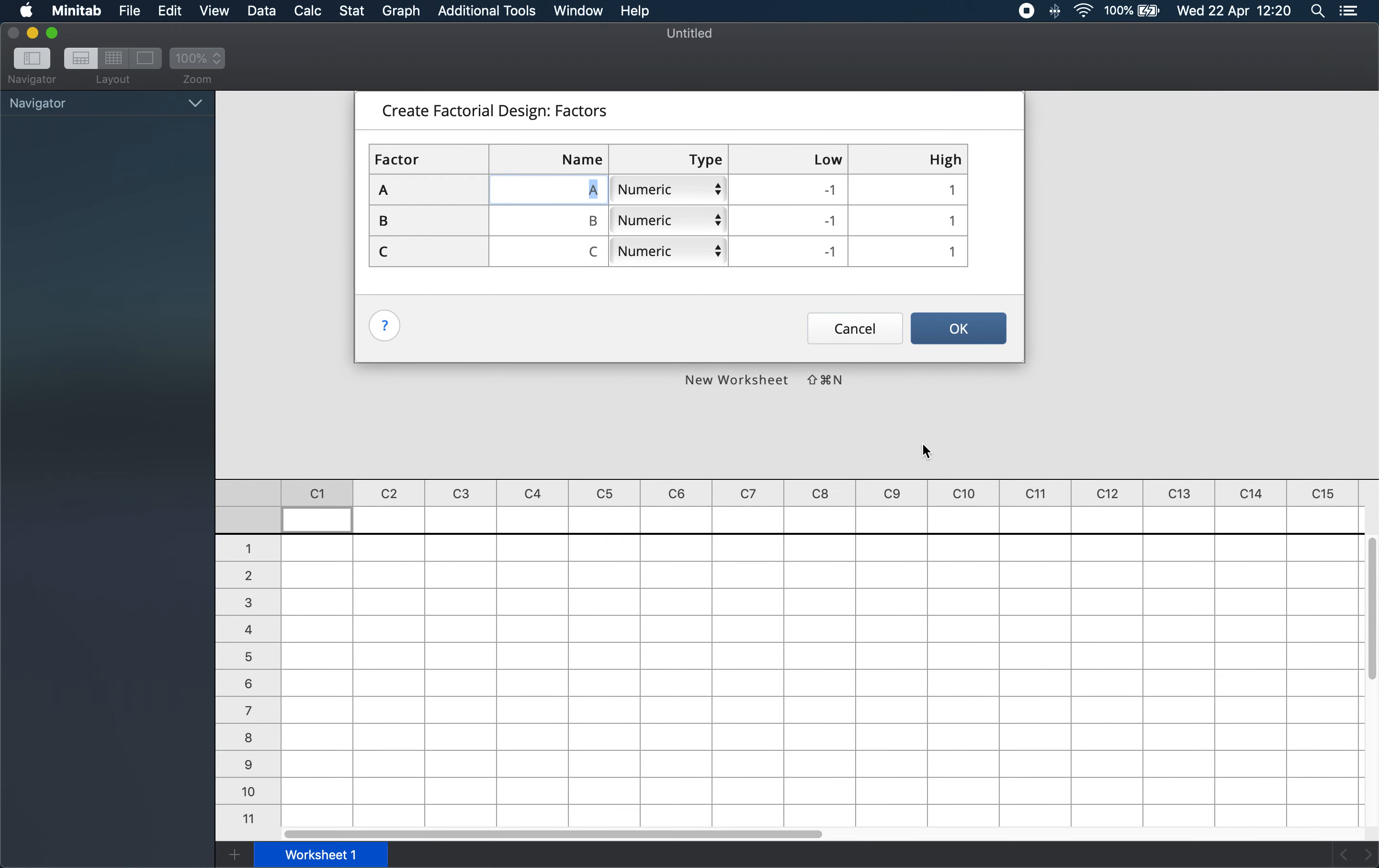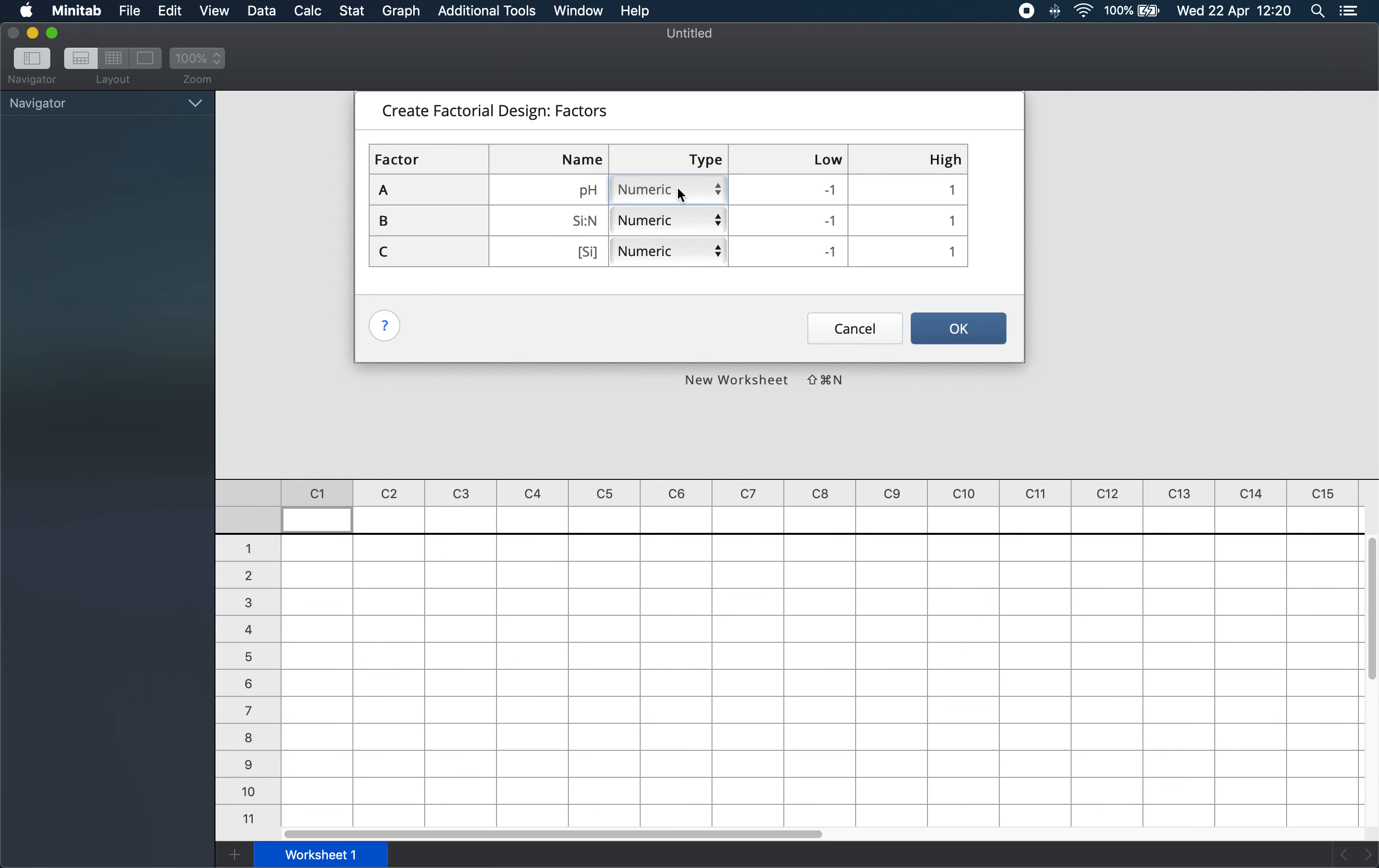Then the next step is to choose our factors. We said we have the pH, the silicon to nitrogen ratio, and the silicon concentration. Now any factor can be either numeric or quantitative, or it can be text, that means qualitative. The pH, because it's possible to change the pH over a range, would be a good candidate for a numeric factor. But if you investigate two different types of reactants, then that factor would be a good candidate for a qualitative or text factor.